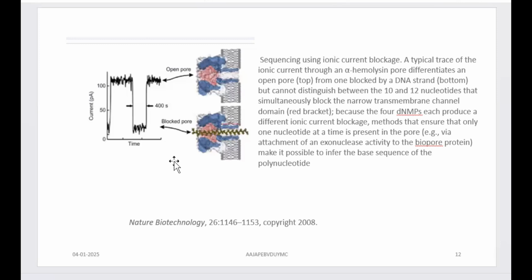When you talk about nanopores, there is one more term, solid state nanopore. The biological nanopores have been extensively developed, but they have a limited shelf life, limited reuse potential, and difficulty in engineering them. These are the concerns. So synthetic nanopores could be the more promising ones.